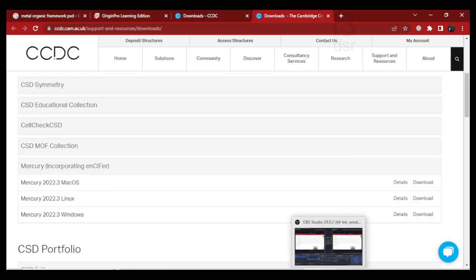I have downloaded this version which is called this one.